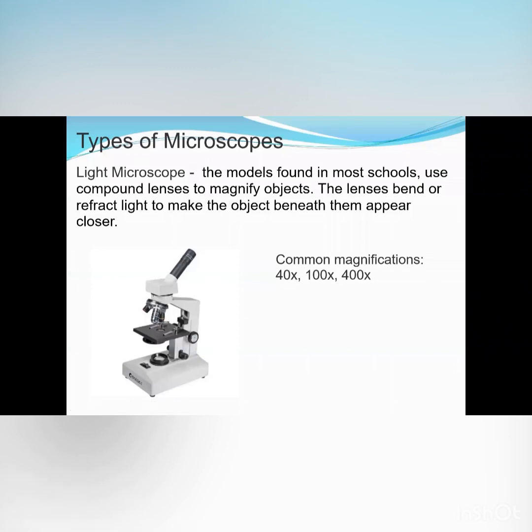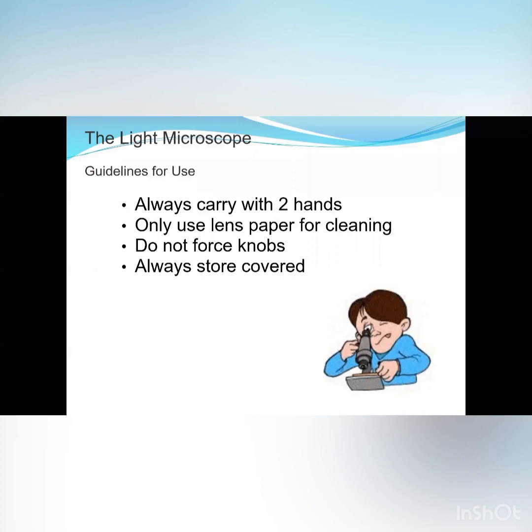As you know, light microscopy is used to make small structures and samples visible by providing a magnified image, for example magnified 400 times, of how they interact with visible light: their absorption, reflection, and also their scattering. This is useful to understand what the sample looks like and what it is made of, but it also allows us to see processes, such as how substances diffuse across a cell membrane. So this is really important.